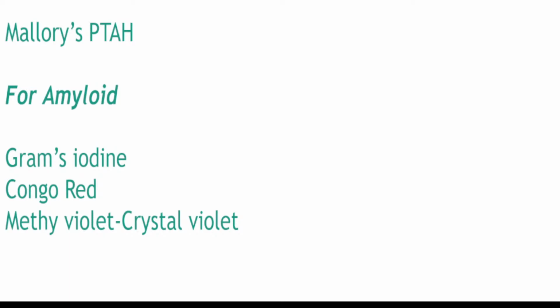The next batch, they asked that question, so that's why I always remember Mallory's. I've never actually known what it is, but I know in the exams in the Philippines they will ask you questions about fibrin stain. So don't forget about Mallory's. It stands for something else, but for the purpose of discussion and in your board exam, I don't want you to remember or understand unnecessary ideas. I just want you to remember Mallory's, fibrin.